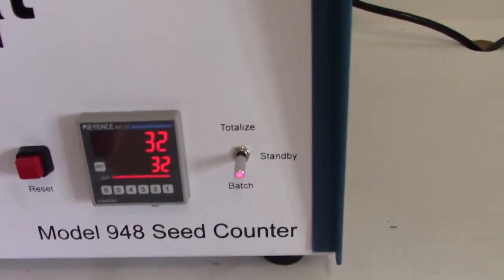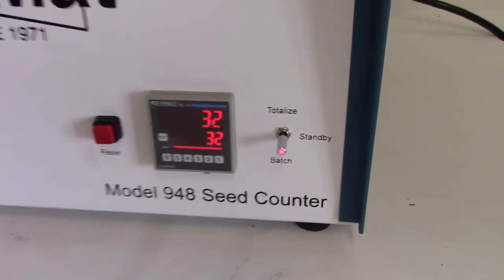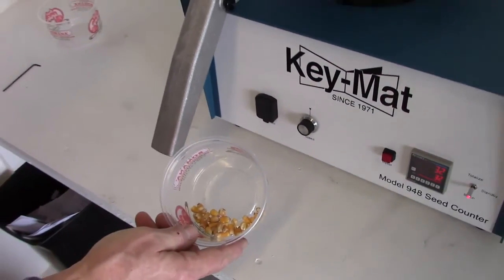So the counter runs by itself until the count has been reached, at which time it stops again, and we now have accumulated a batch of 32 seeds.